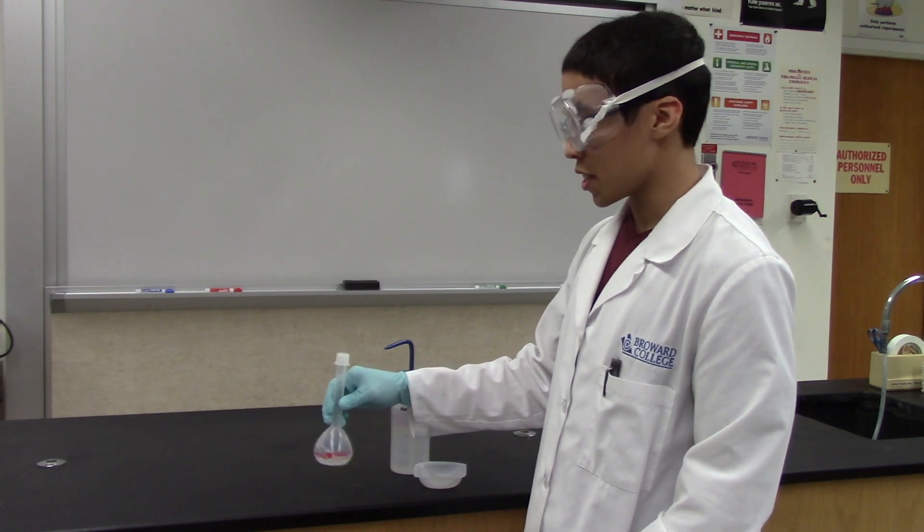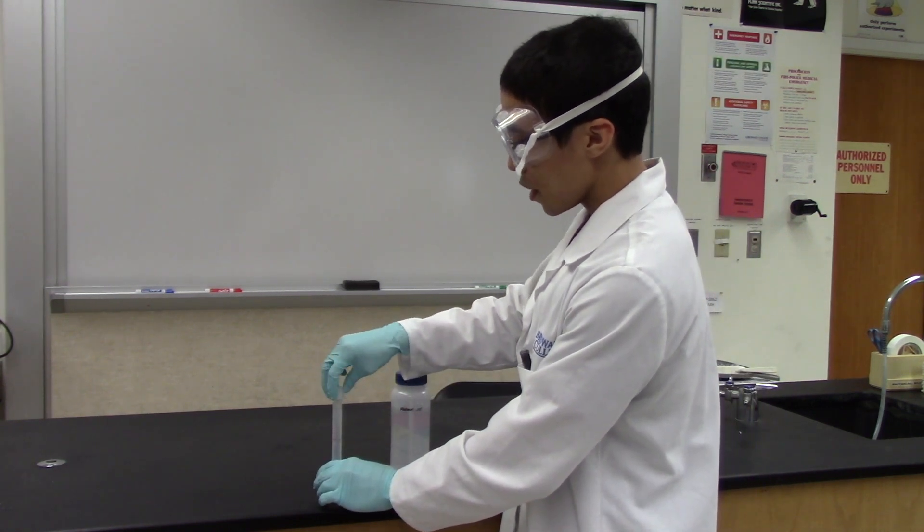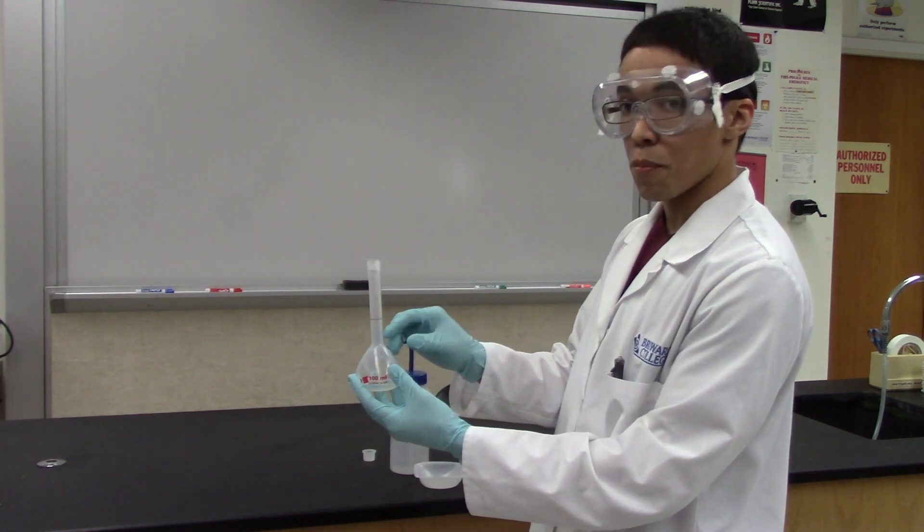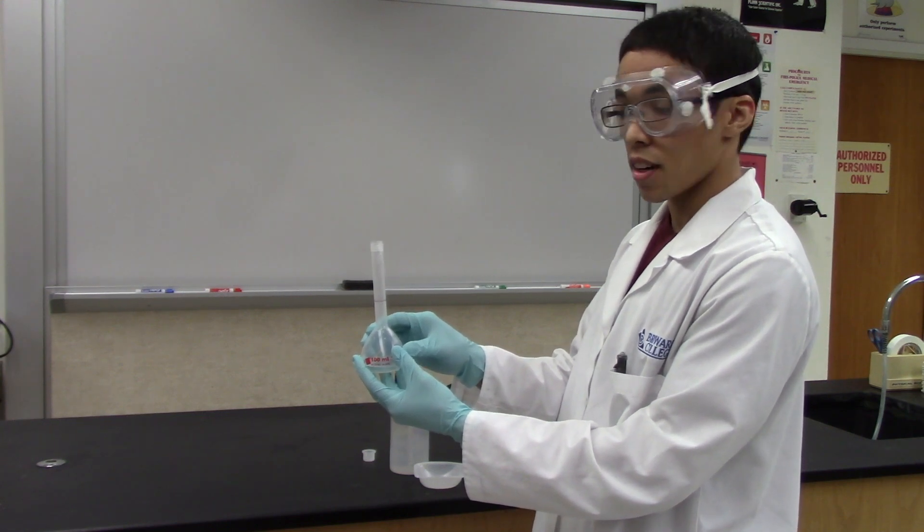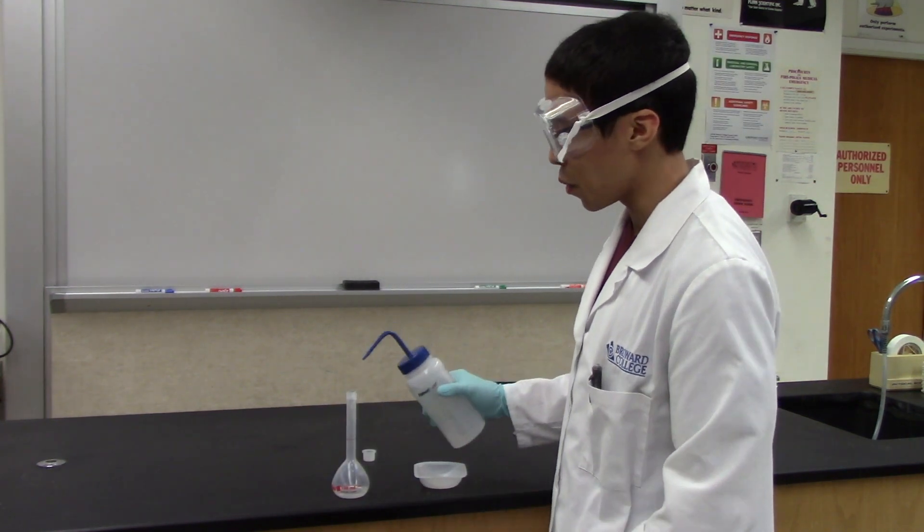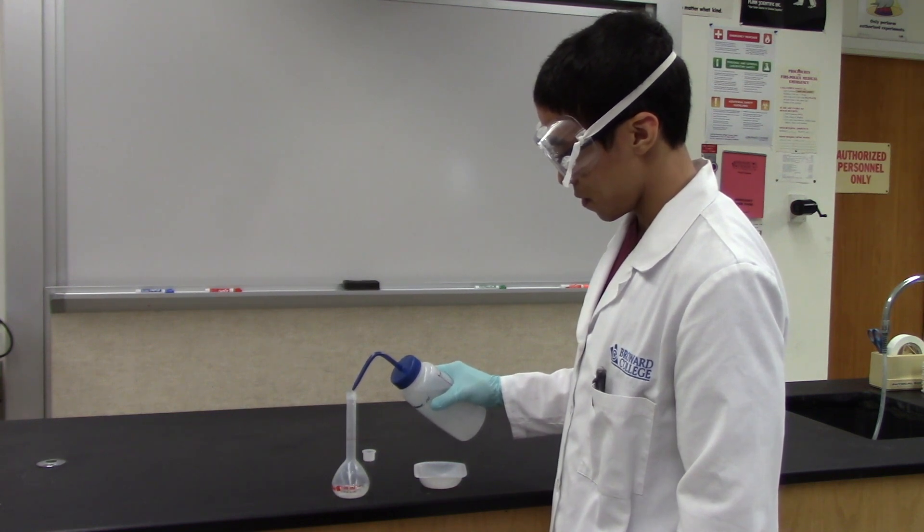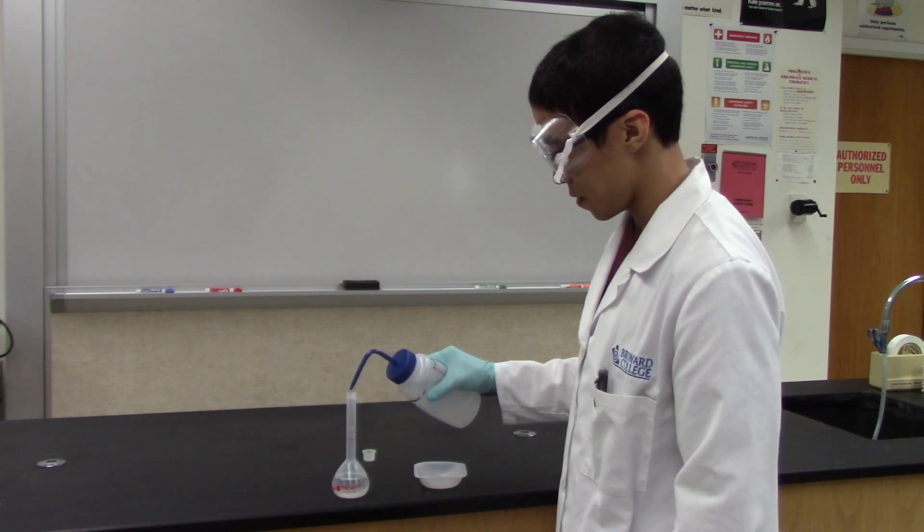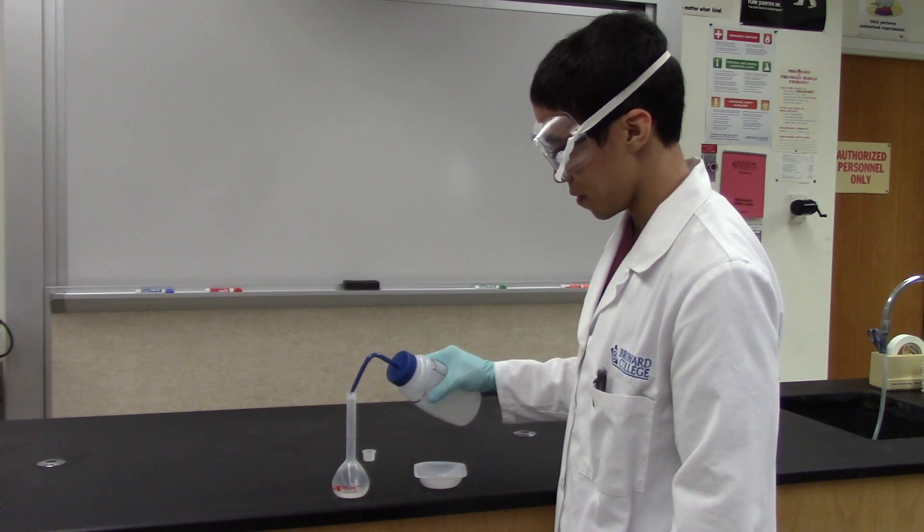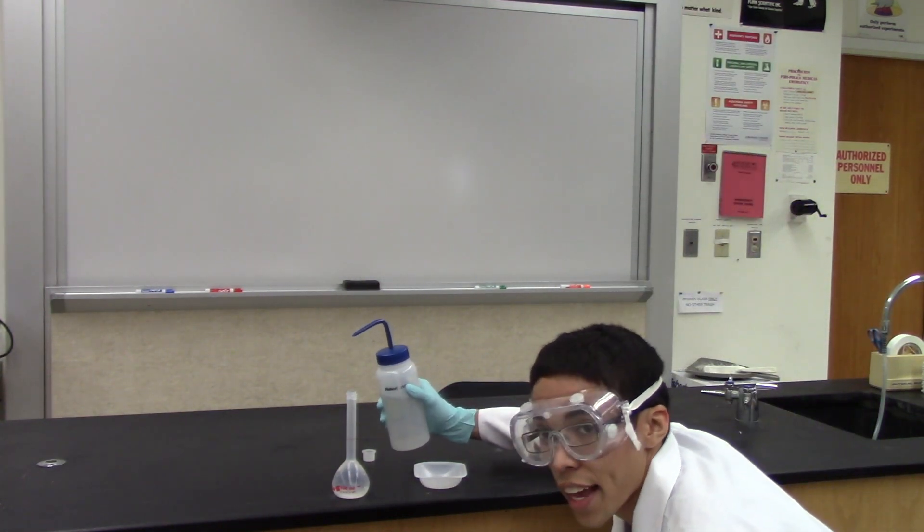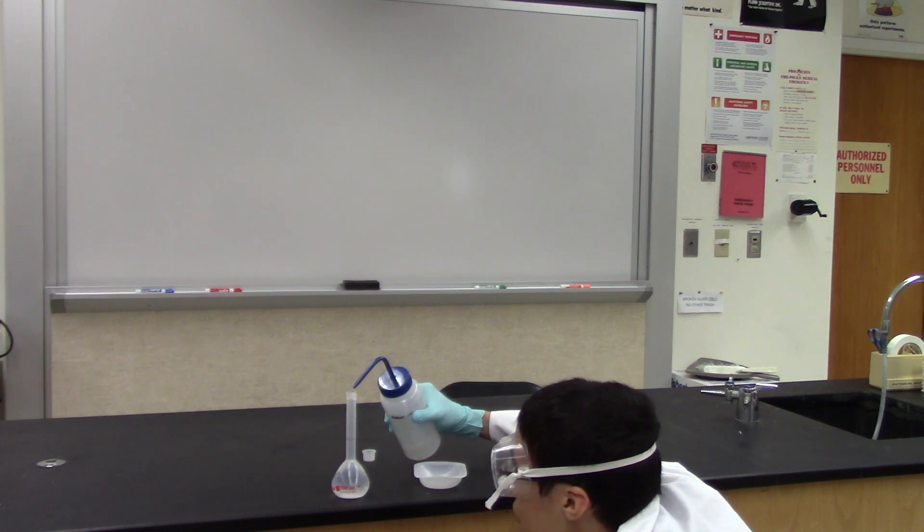Once the antacid tablet has been completely dissolved, you will then bring up the volume inside the volumetric flask up to the red line. Make sure that the bottom of the meniscus of the water just barely touches the red line. You will do this using more distilled water. As you approach the red line, make sure you are at eye level to get an accurate reading, and be careful not to go past the red line.